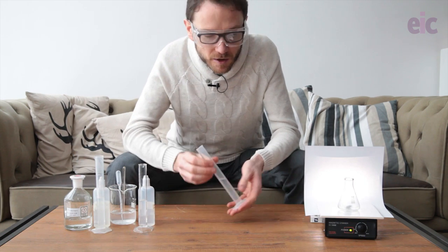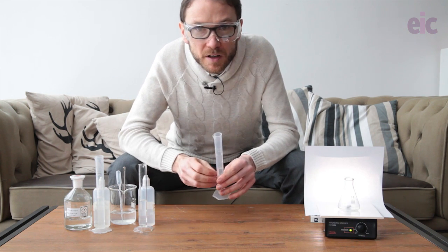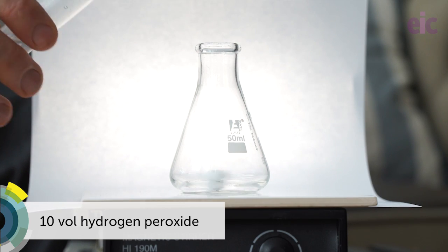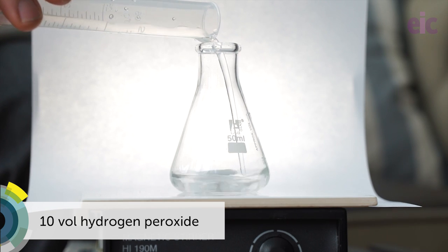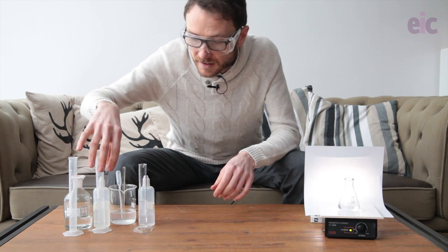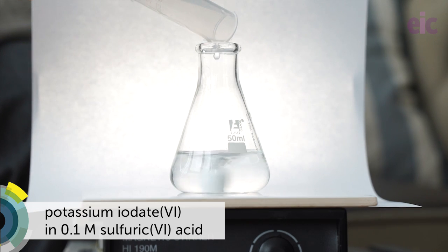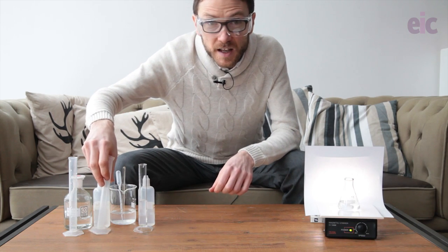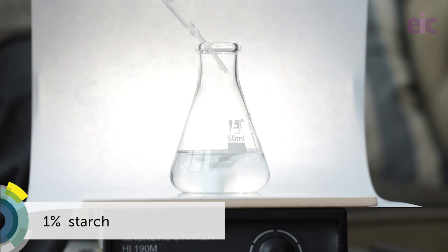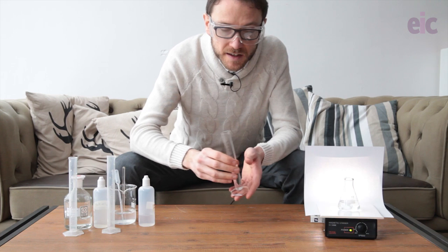Start with about 15-20 ml of each of the other solutions and about 1 ml of the starch. Add them in this order: beginning with the peroxide, followed by the iodate in the sulfuric acid, then about a ml of starch as an indicator, and finally the malonic acid.